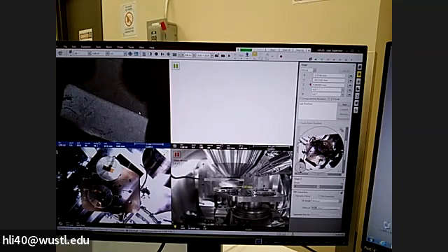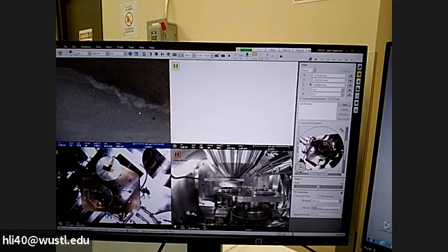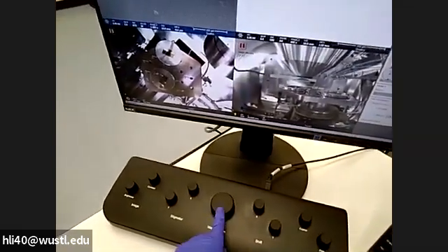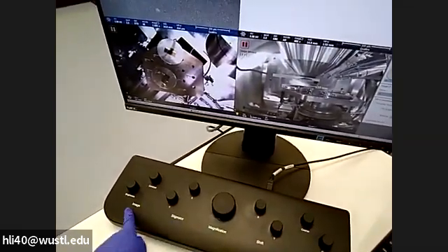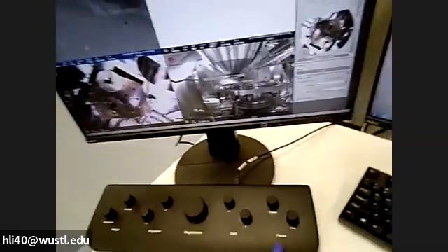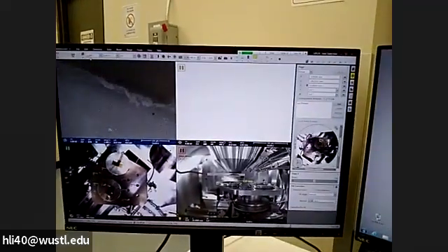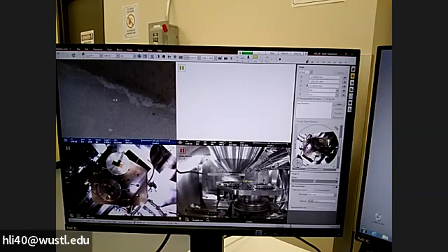Now we can change the magnification. So when you zoom in, we have magnification button here, or you can select magnification. Normally, I will use the knob, okay, which is you have see here the magnification knob, the stigmator, image shift, and focus. So normally I would like to use the knobs rather than we do have soft key to do focus. For example, if you right click, you will actually do the focus. Move left and right, it will do the focus. But I prefer to do that.